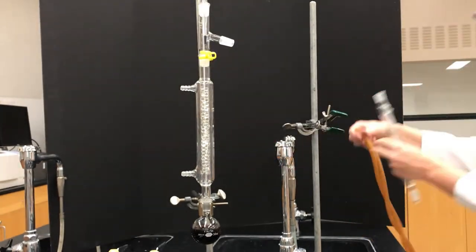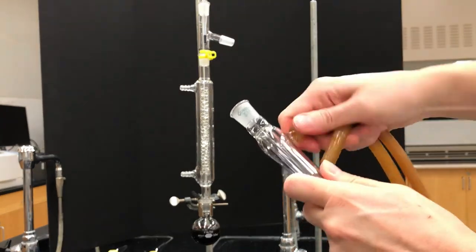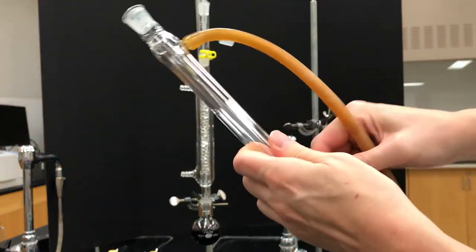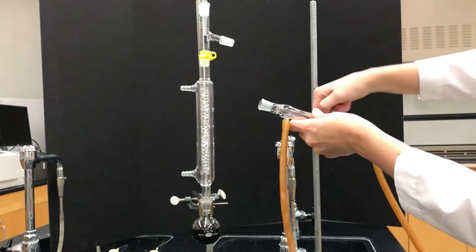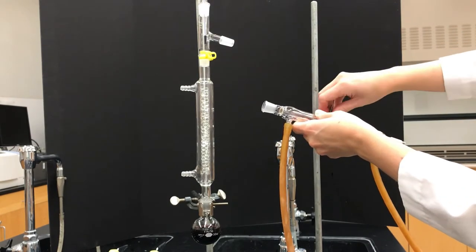Next is the condenser. And again, you want to wet the hoses with some water first so that they can twist on much more easily. And then the awkward part of trying to connect the condenser up to the three-way adapter.